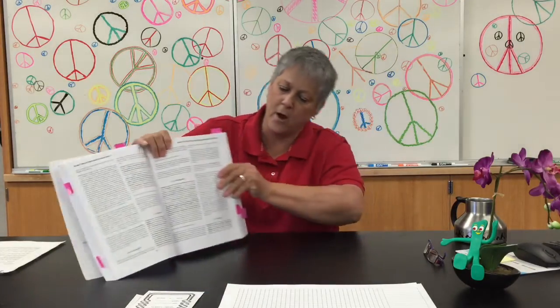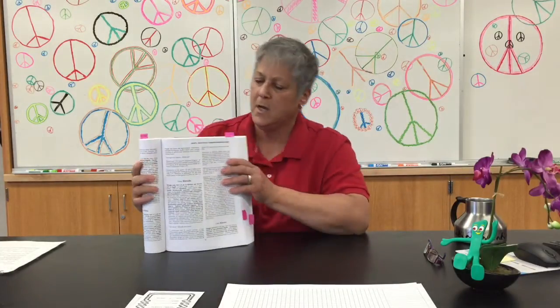And I'm going to take a look at, if I can find the page, there is a big, fat, juicy paragraph here. I'm sure you can't see this, but I'm going to do this anyways, that says Klebsiella, and it gives a description of the genus. Now, I'm primarily interested in the information that's in boldface.